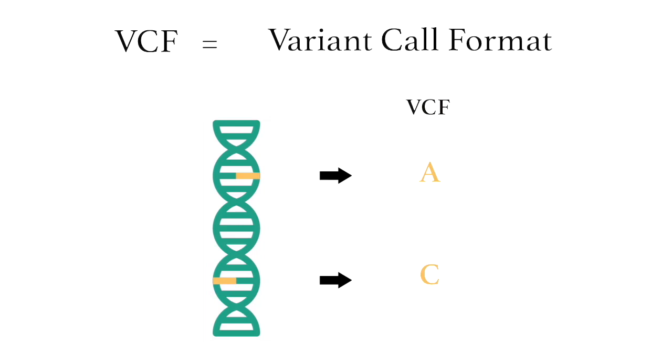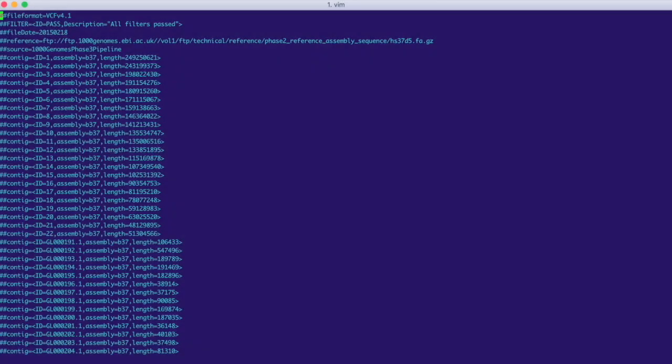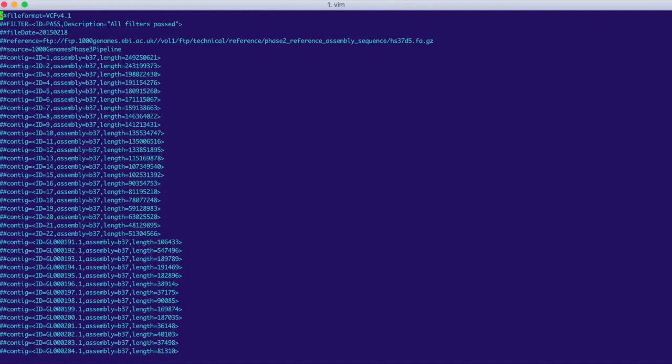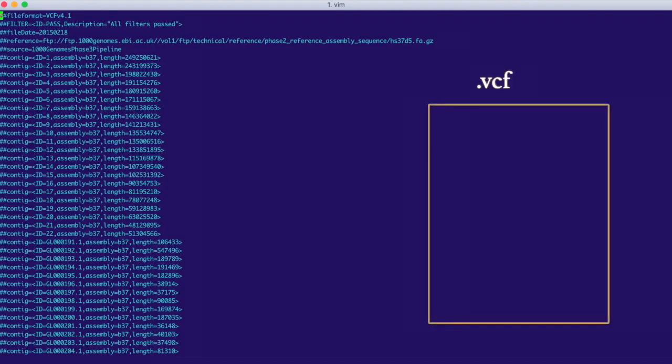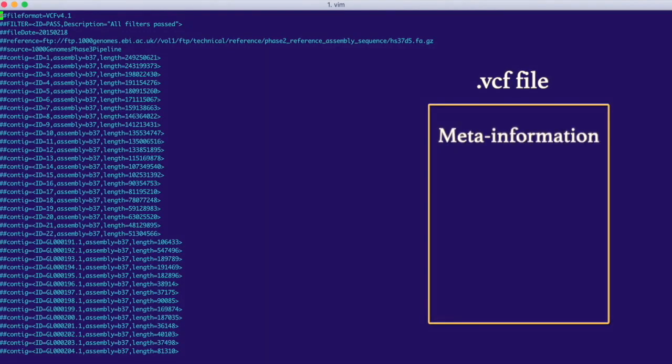So here it is, this is the top of our VCF file. As we scroll down, we're going to see the three parts that make up a VCF: the meta information, the header, and the variants.